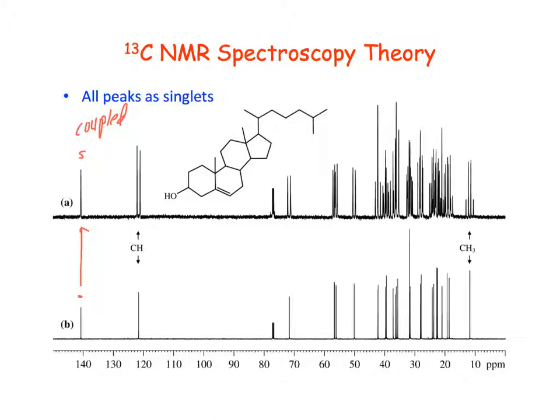There's no hydrogens attached. So that's the proton on top, just to make sure, right? No, just the spectrum on top. No, that's the coupled C13 spectrum. Oh, okay. Just want to make sure.